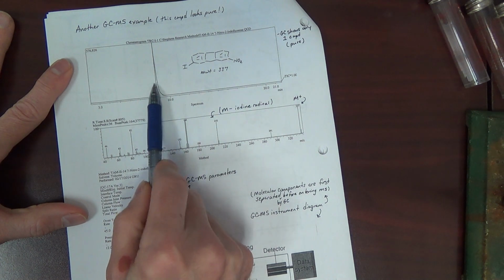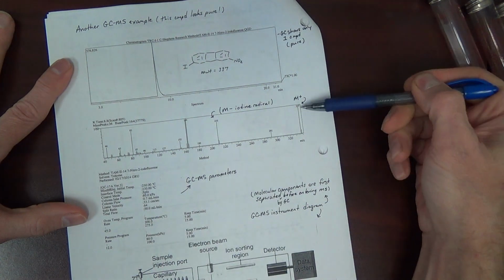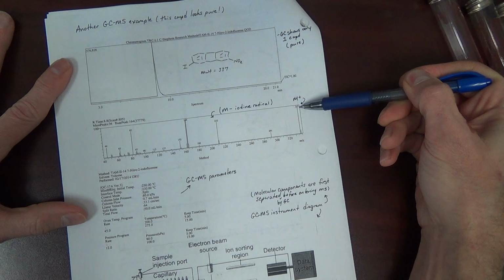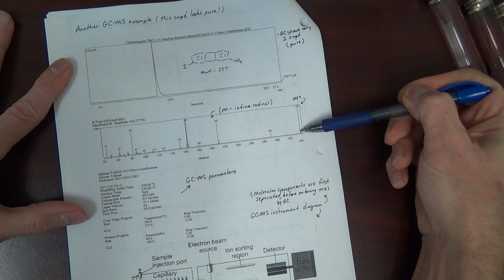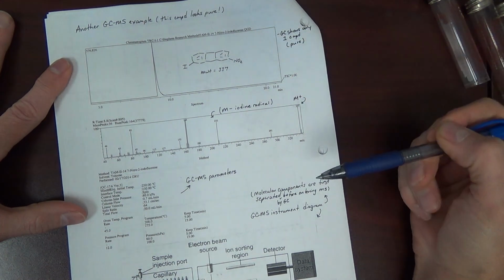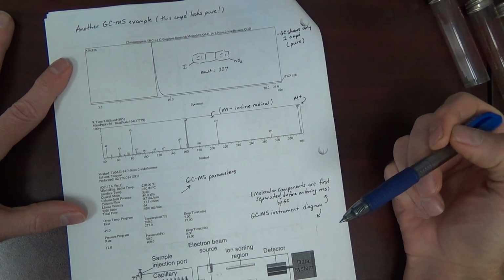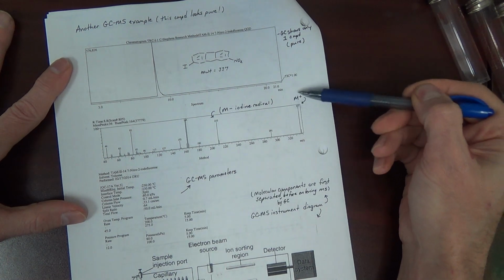Then we can get a mass spec of this. The mass of this is 337, and you see the mass spec shows a molecular ion of 337. This is probably some carbon-13 isotope. And 337 is good evidence that we have this molecule. We could then get other evidence. Again, you like to have multiple pieces of evidence to prove a structure.